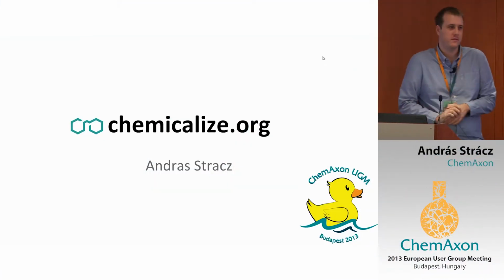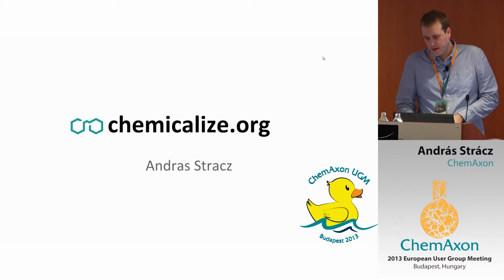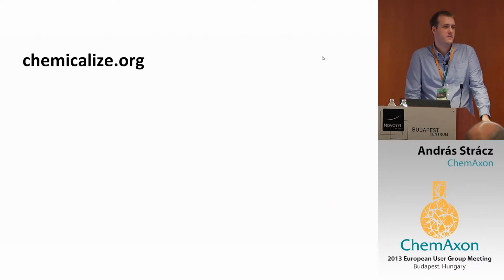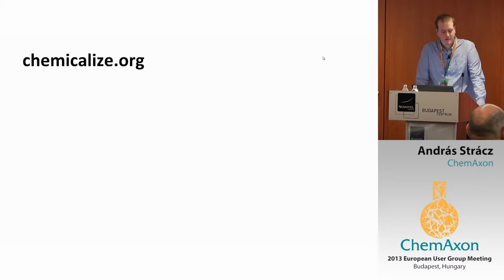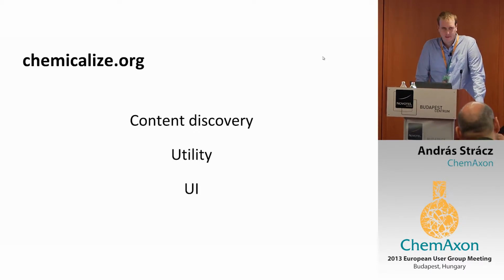Okay, thank you, John. Before we get to this Plexus thing everybody's talking about, I want to show you what's new with chemicalize.org. So let's start that. When we describe chemicalize.org nowadays, it's mainly about these three things: content discovery, utility, and UI.